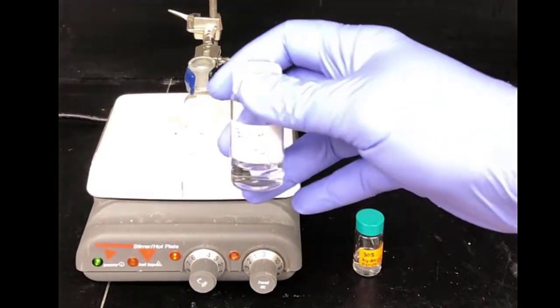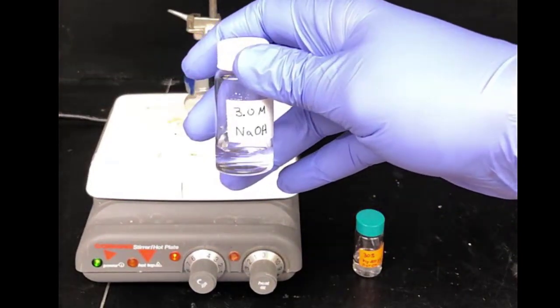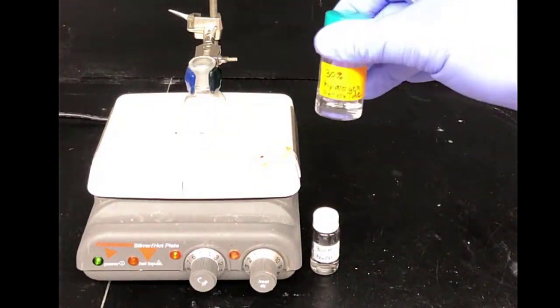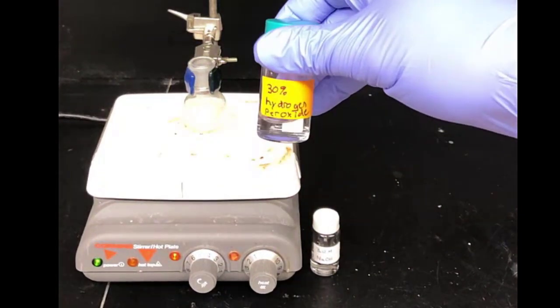In this experiment, we'll be using two reagents. The first one is three molar NaOH, sodium hydroxide, and the second one is 30% aqueous hydrogen peroxide.